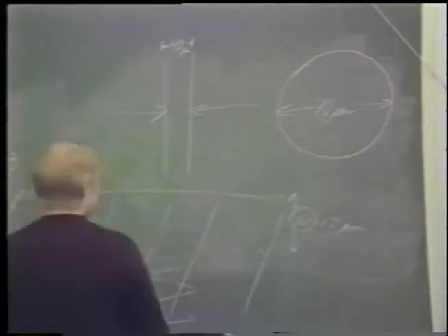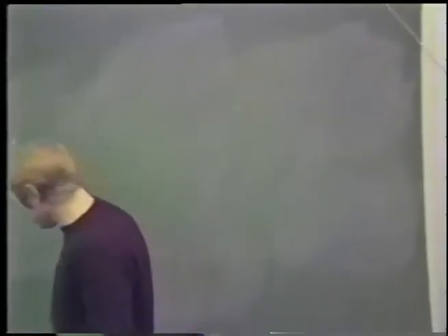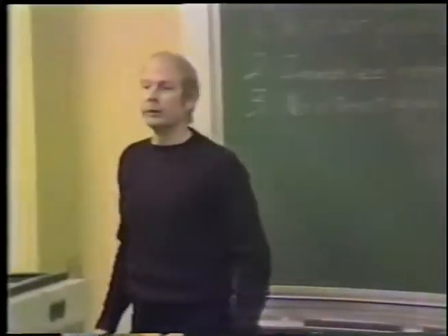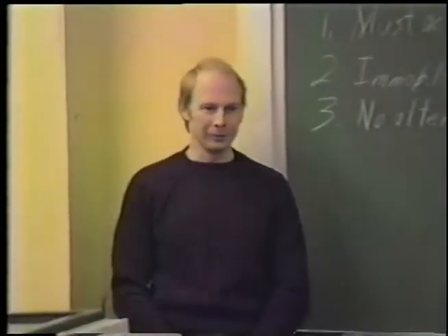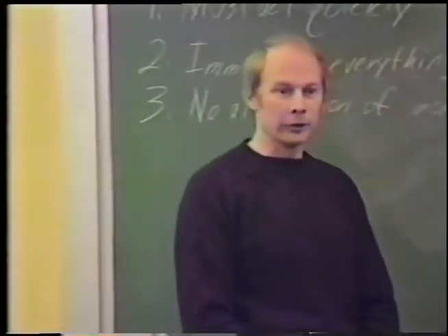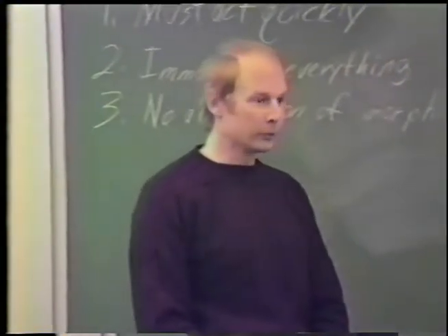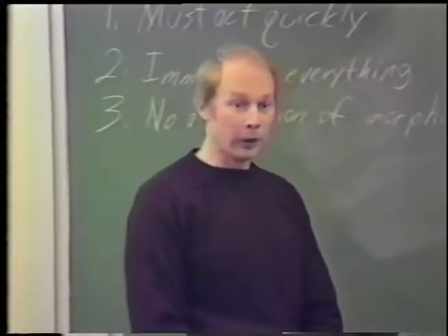Now, we've already discussed chemical means of cryoprotection. We found that they are not optimal. Other means of cryoprotection have been employed. One of these means is very commonly employed, usually inadvertently, and that's drying of the sample. In a few cases, it's been done deliberately. If you dry the sample, you can increase the solute concentration, and this in itself tends to suppress nucleation and growth of ice crystals. But it also causes a lot of artifacts, changes in morphology, if nothing else.